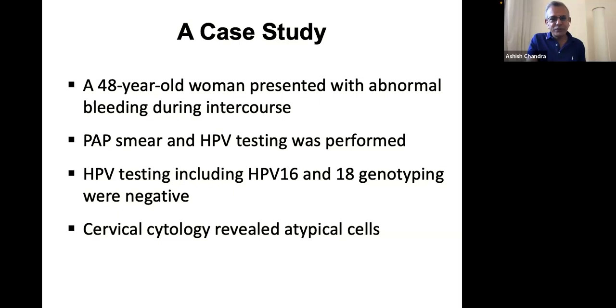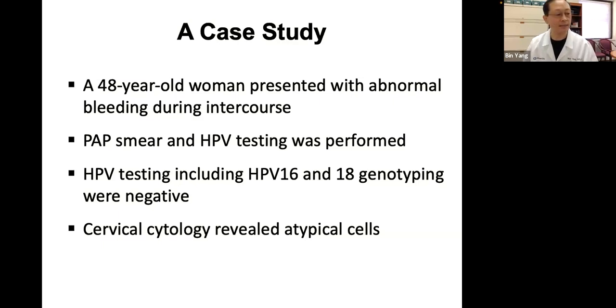So there is a question here for quality control: what should the ASC to HPV ratio be? Do you have any advice? That was a great study. I think it was more than 10 years ago that Dr. Sibas from Harvard, Brigham and Women's, did this great study on using HPV, because your ASC rate, my ASC rate, and another person's ASC rate are different. So how can we, in the HPV testing area, take advantage of HPV testing? That publication was really well received.